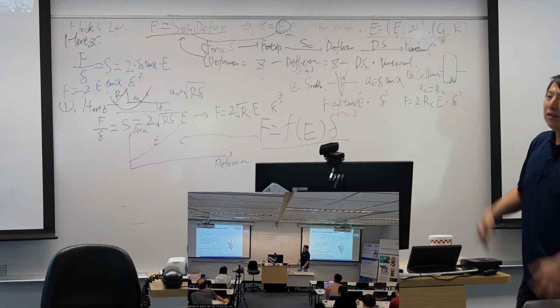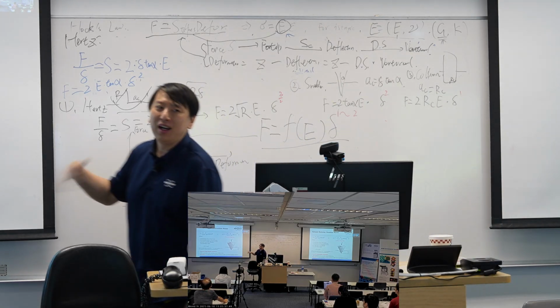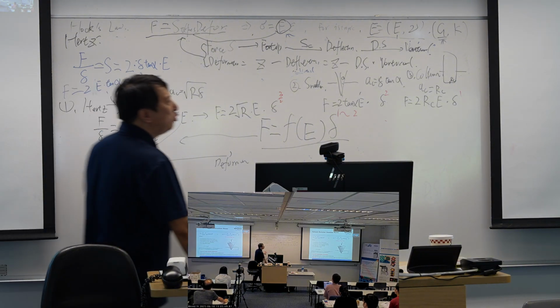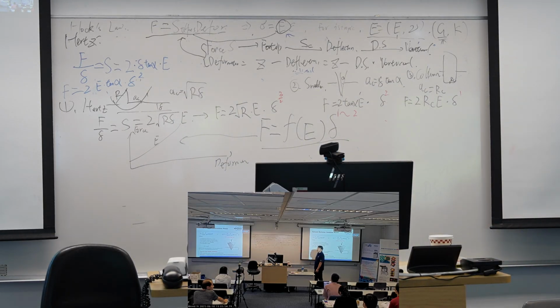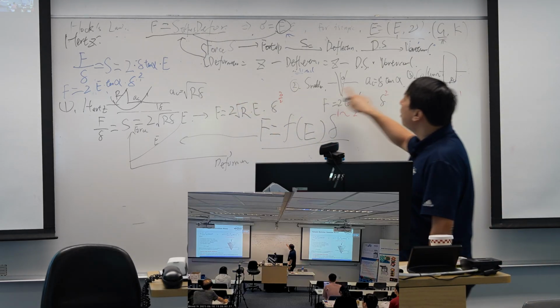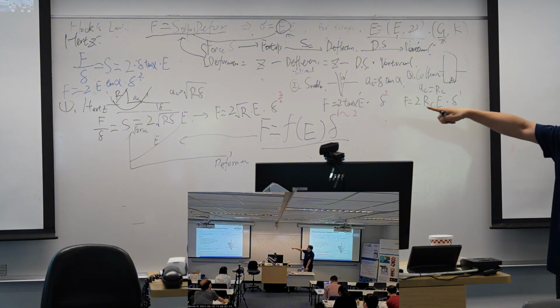Okay, but for AFM probes, the AFM probes are a kind of consumable. It does not require us to do such a good calibration as we do on the nanoindenter. So on AFM, usually we just do it kind of roughly on this step. If we are using one of these specific shapes, we can directly use the theory.